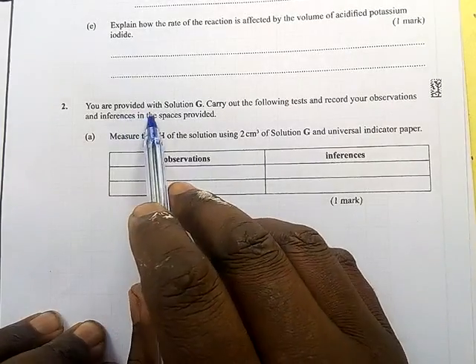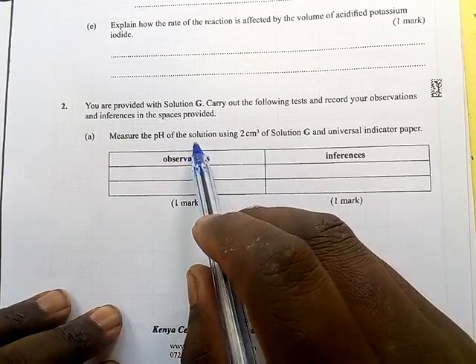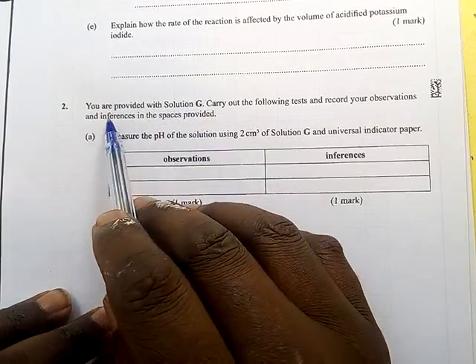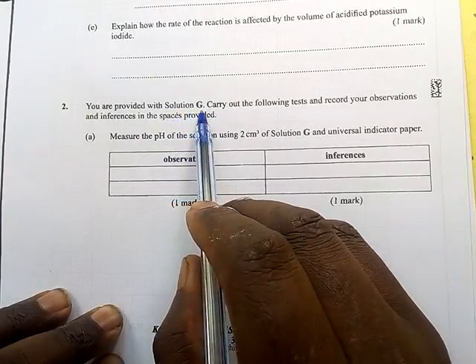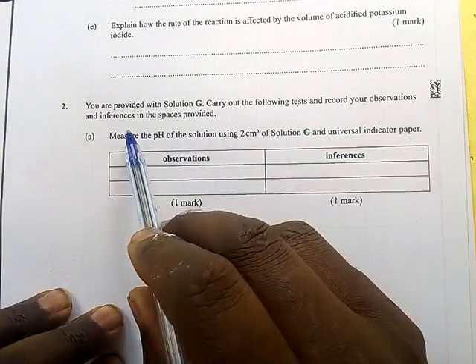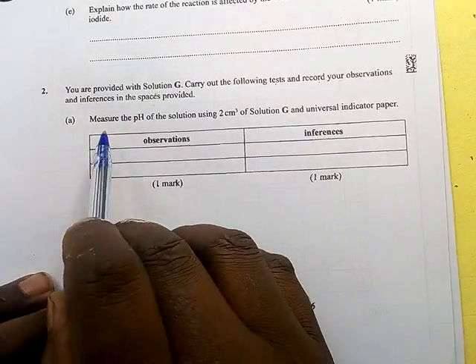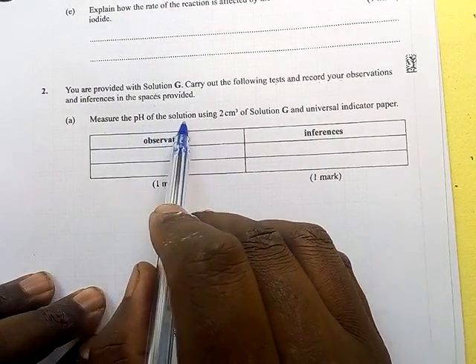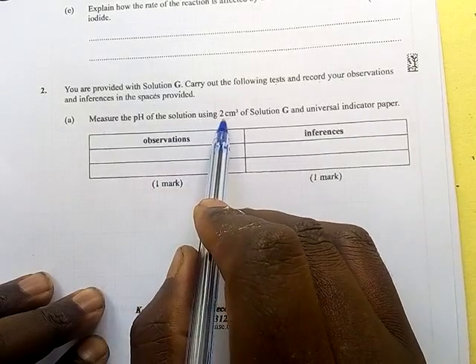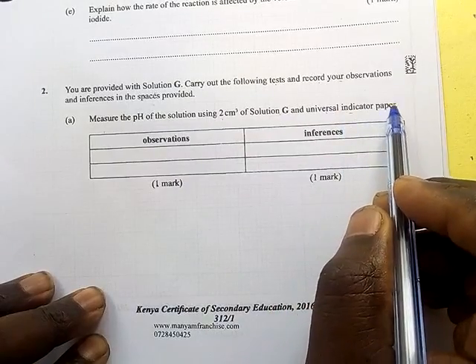You are provided with solution G. So this year they were given a solution. We are used to solids. So you are provided with solution G. Carry out the following tests and record your observations and inferences in the spaces provided. Measure the pH of solution using 2 centimeters cube of solution G and a universal indicator paper.